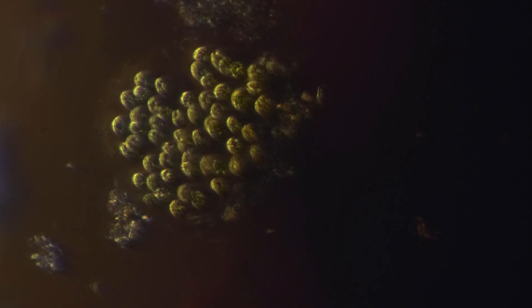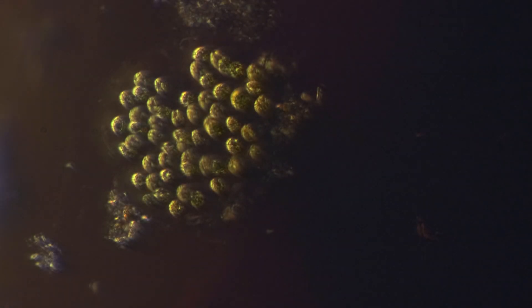Of course, diatoms were not the only kind of microscopic algae living in the mesocosm. There were various individual cells and colonies, such as this one, which I believe to be a form of gonium.